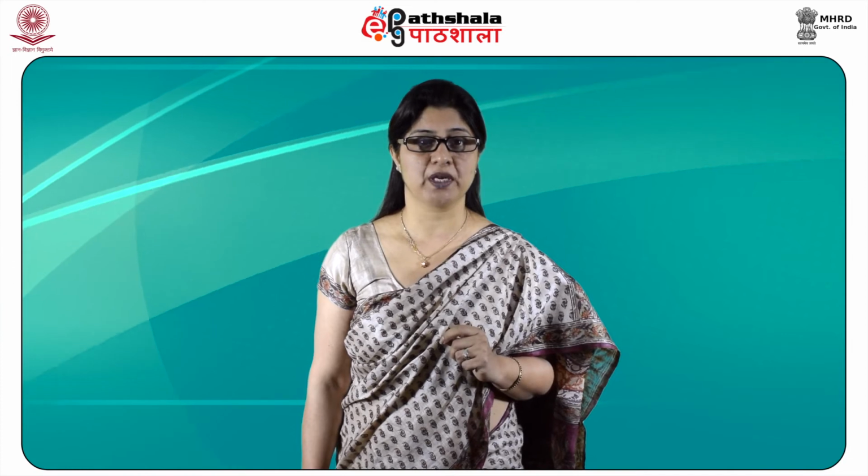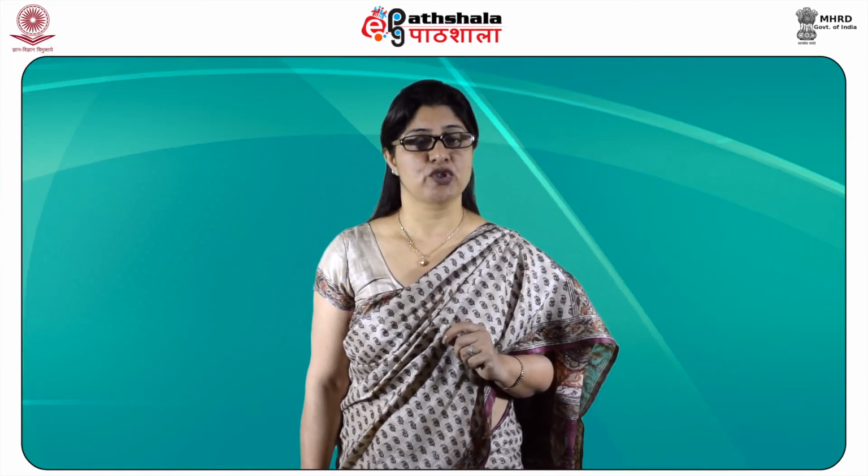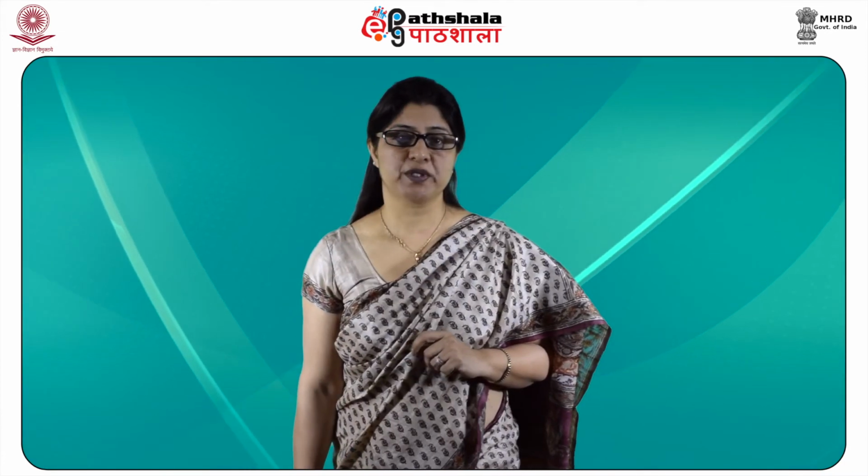Again, as a principle for solving all these questions, first we find out the double bond equivalence. The double bond equivalence, as per the formulas which have been explained to you earlier, is found to be 2. Double bond equivalence shows the presence of 2 double bonds. In the proton NMR data given to us, the 3 protons at 2.0 ppm indicate the presence of a COCH3 group. The IR absorption at 1720 cm inverse proves the presence of a carbonyl group.